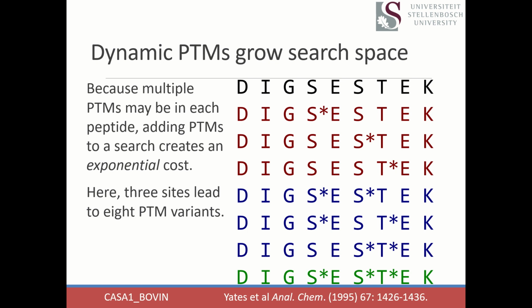However, let's return to this question of phosphopeptides. Here I've grabbed a short peptide sequence out of alpha-casein from cows. So we note that we have 3 different sites within this peptide sequence that match our phosphorylation definition. This serine, that serine, or the threonine over here, any of those may be modified or may not be.